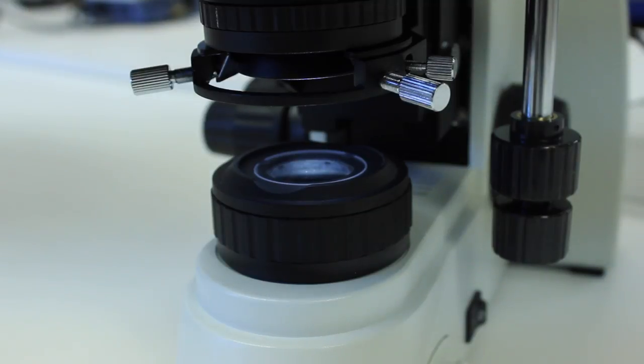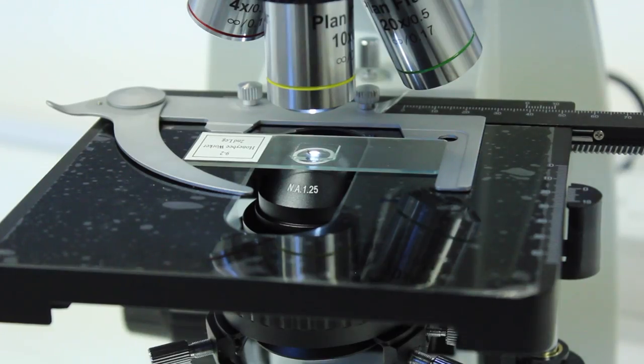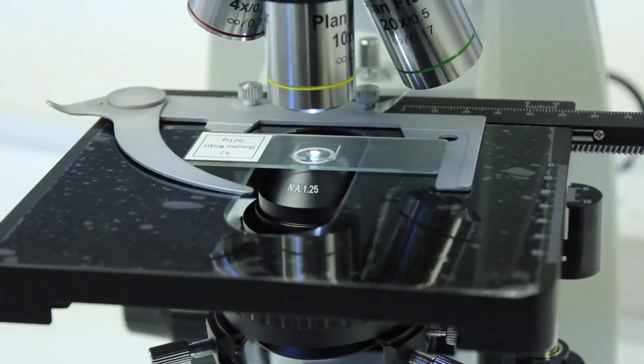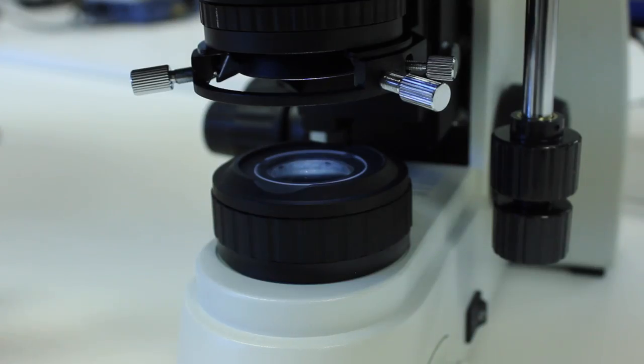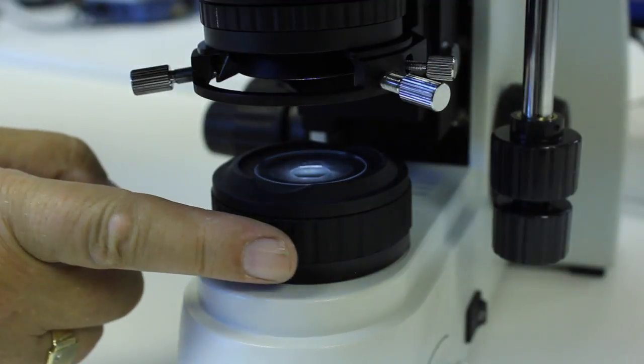We're now going to go through the process of setting up Kohler Illumination. Put a slide on the stage and put it in focus with the x10 objective, and then fully close the field iris down here so it is completely closed.